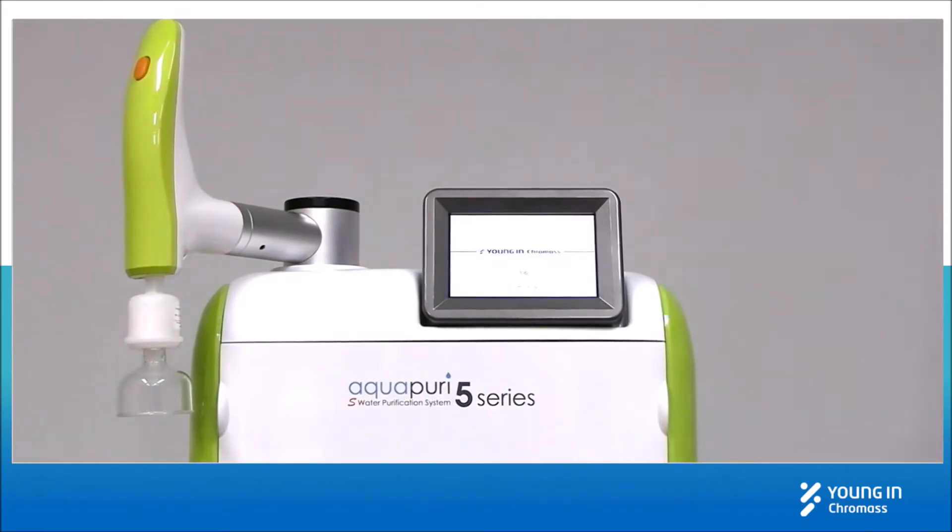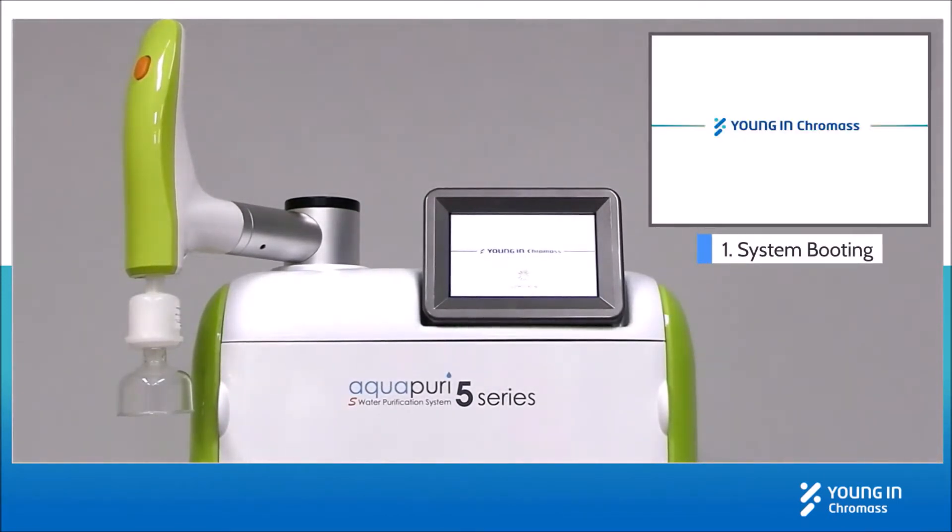Press the power button on the rear side of the system. Then the system will begin booting to start.